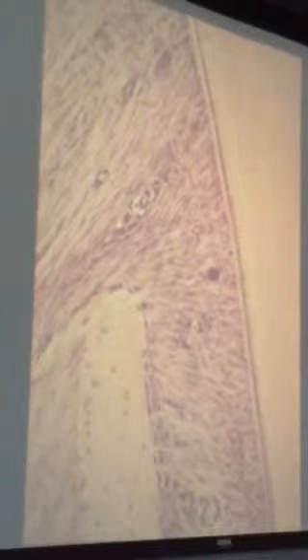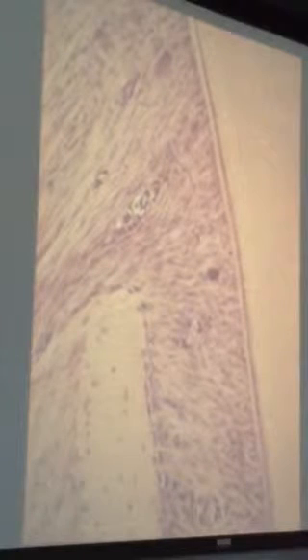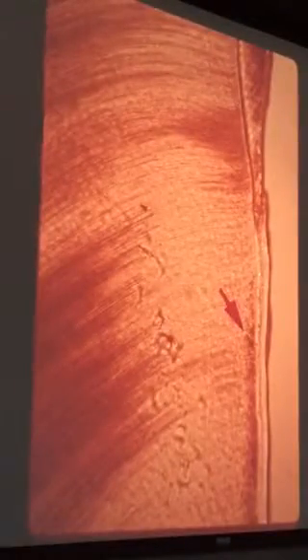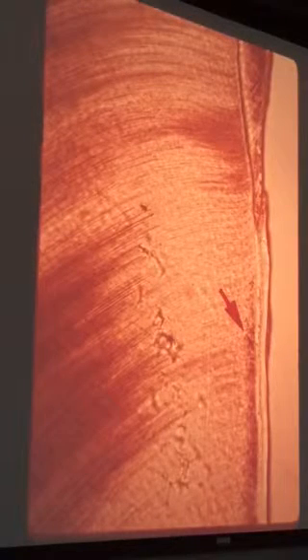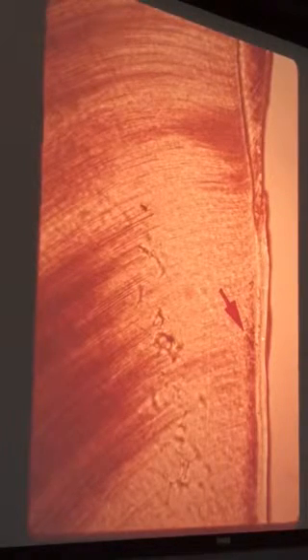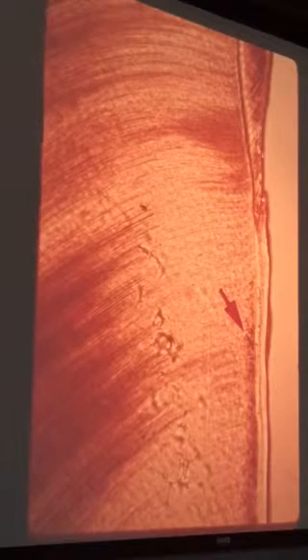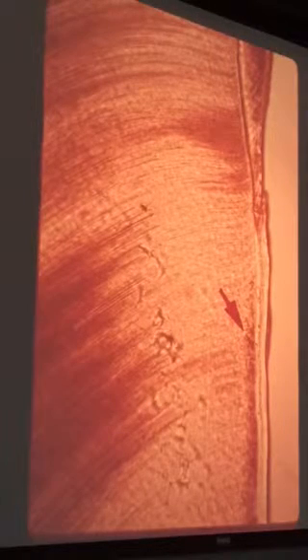Okay, and this fiber group right there, periosteal fibers, and that's not well shown. Now let's go on to the next one. How about this tissue right there? Acellular cementum. And right there we have that overlapping area, which is characteristic. There's the enamel right there. So there is the CEJ.